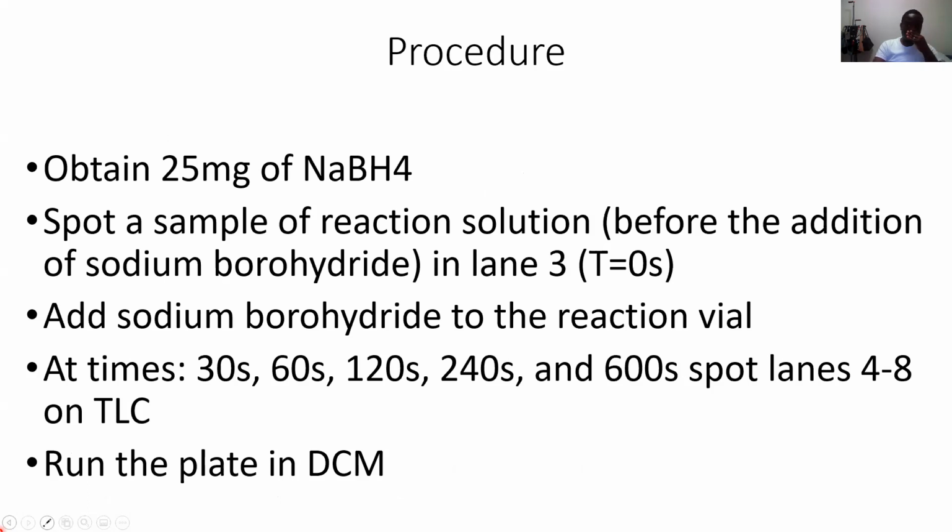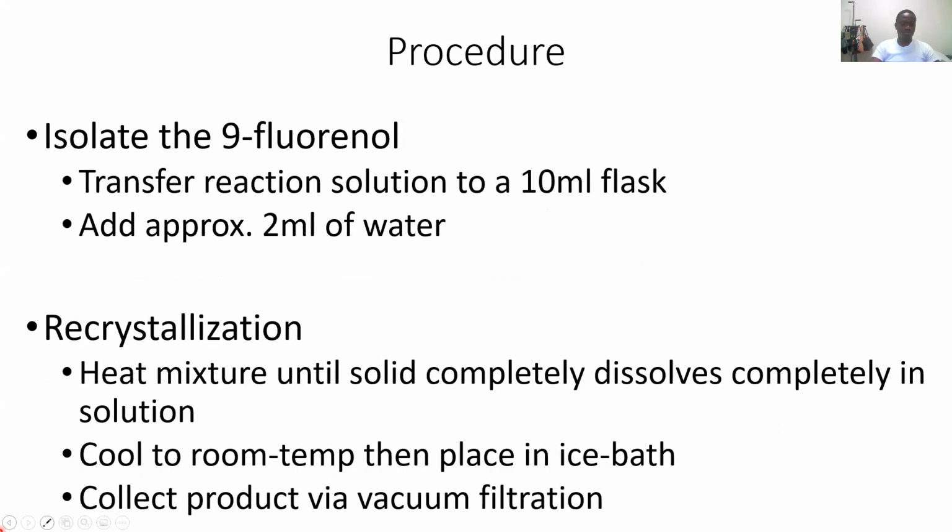Take note that what we want you to see is your starting material being converted into product as the reaction progresses. The reaction may or may not go to completion. What I mean is you might not get to a point where you get exclusively product. You might still have some starting material. But at the end of the day, you should be able to see the intensity of your starting material fade over those time points and the intensity of your product increase over those time points. And that tells you that the reaction is progressing. It's moving the way you want it to move.